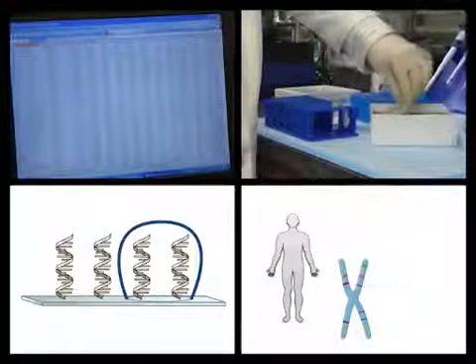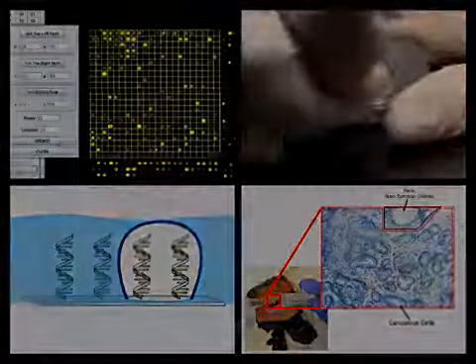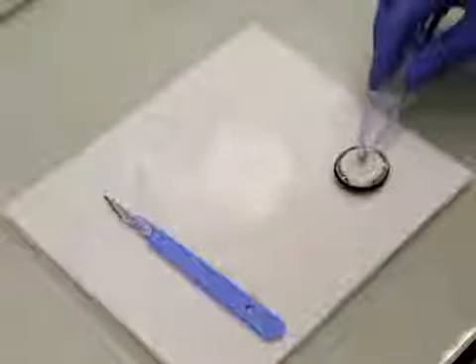You've just watched JoVE's video on gene expression profiling using microarrays. This video covered the basic principles of microarray technology, a protocol for expression profiling, and applications of this technique.